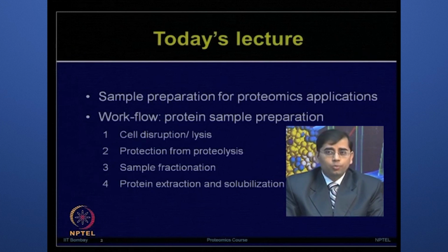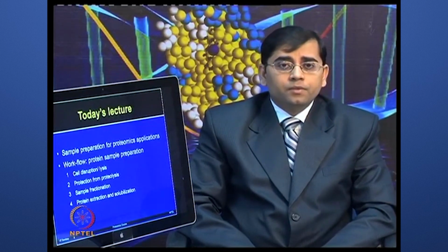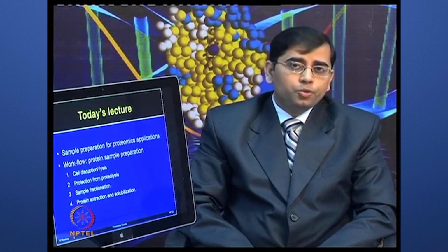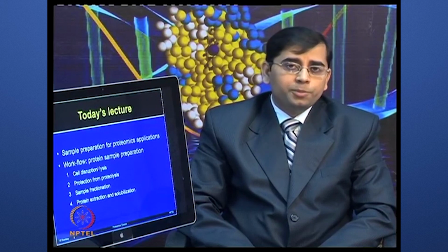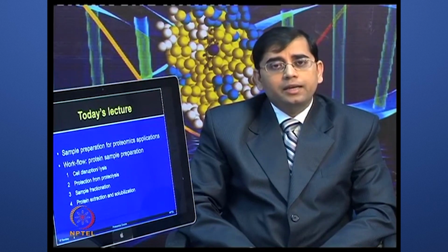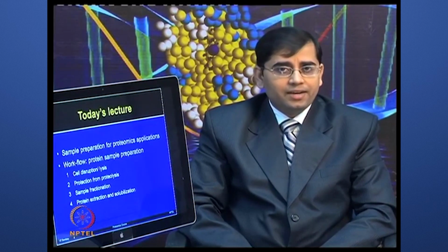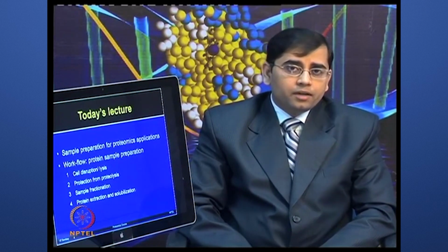Protein extraction and solubilization are another very essential component. Now, when we are talking about the sample preparation, this is quite generic for different types of proteomic application, whether one wants to use gel based approaches or gel free approaches. So, whether you want to use 2-dimensional electrophoresis, dyes or different types of gel based applications, or you want to perform mass spectrometry and different types of label free techniques, you have to ensure that you are starting with a very good protein extract. But sample solubilization and some other components are added more when you are performing the gel based proteomics.